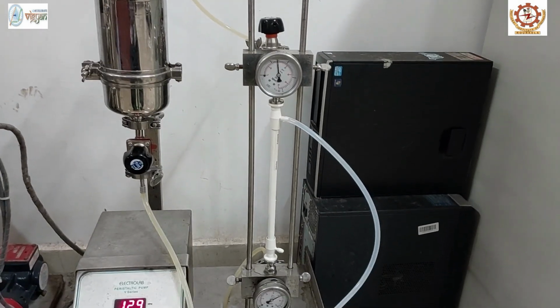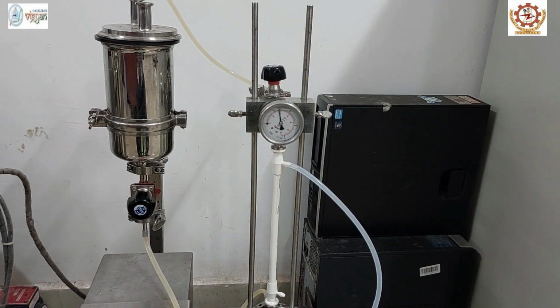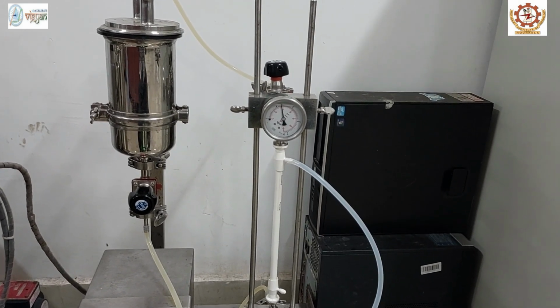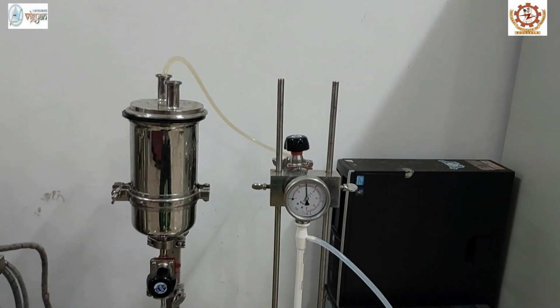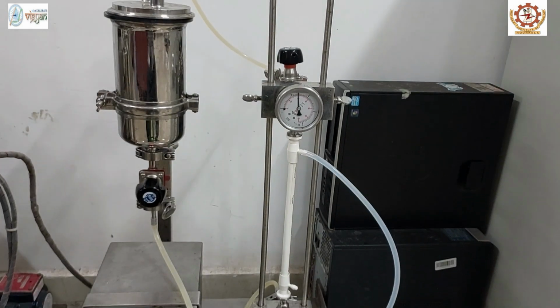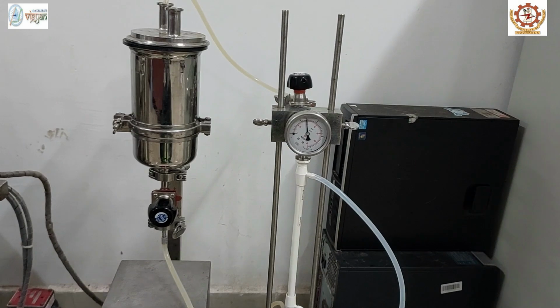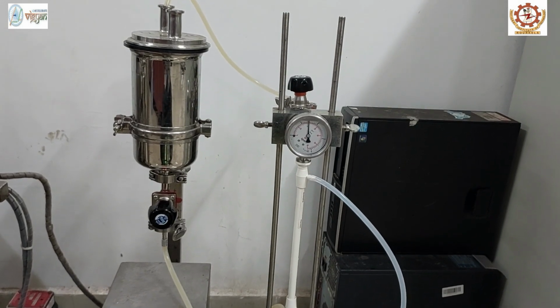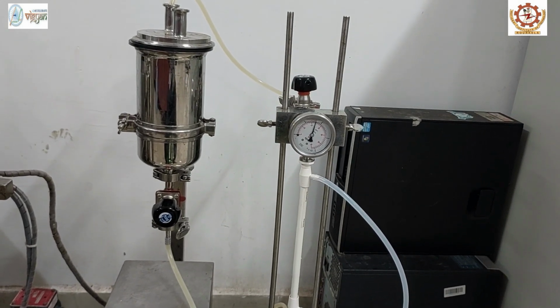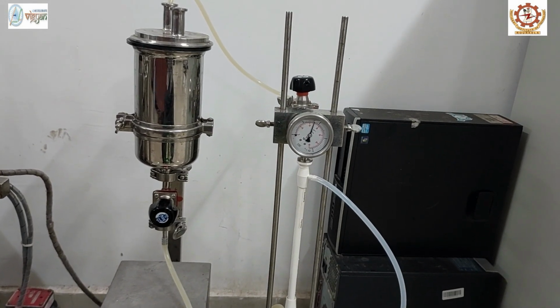In forward flushing, permeate or feed water is flushed more rapidly into the membrane at high hydraulic pressure. This rapid flow results in high turbulence, and due to this, the impurities deposited on the membrane surface are discharged and released. However, the contaminants that blocked the membrane pores must be removed by backward flushing.